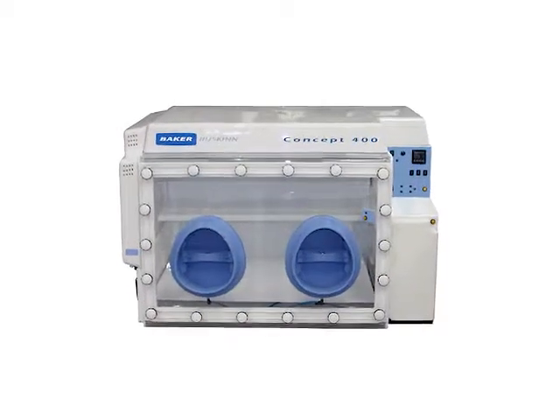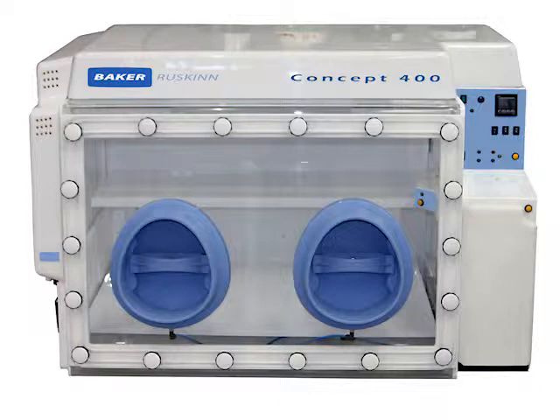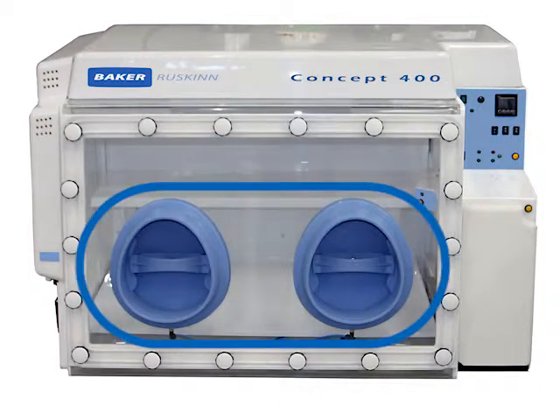For quick and easy access to your hypoxia, anaerobic, or microaerophilic workstation, Baker-Ruskin offers the Easy-In port system, available on select InVivo 2 and Concept products.